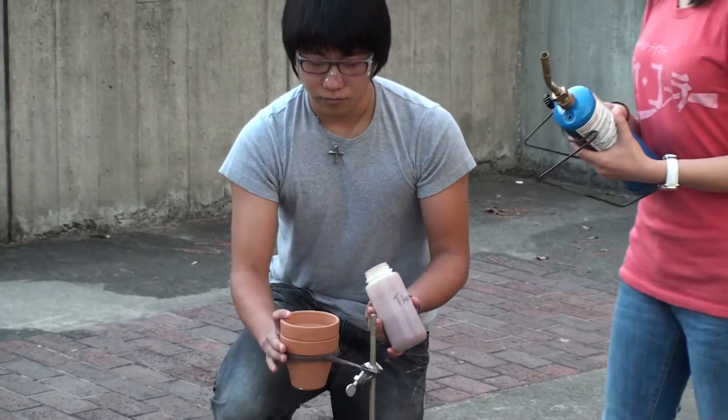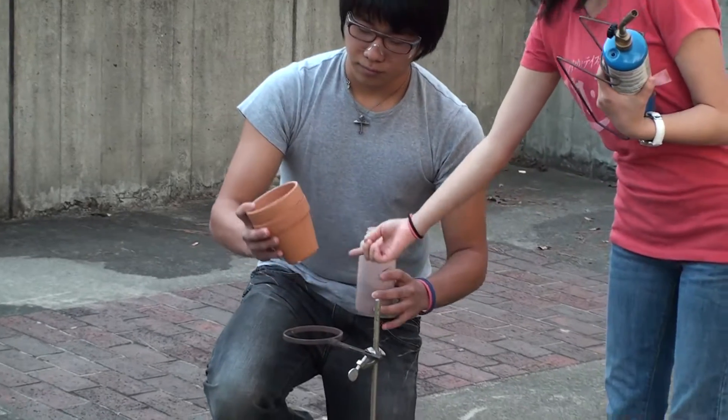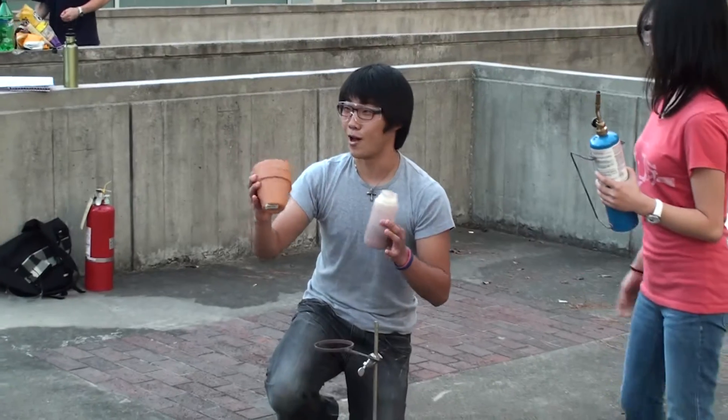The reaction is very exothermic. In the end, the molten iron will go to the iron pot at the bottom of the flower pot. I'll just show you that the bottom of the flower pot is intact — you'll see why I'm showing you that.